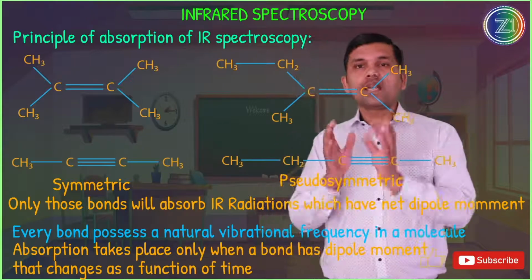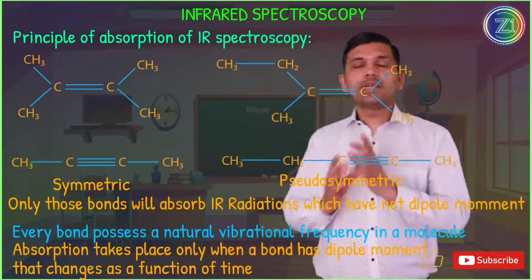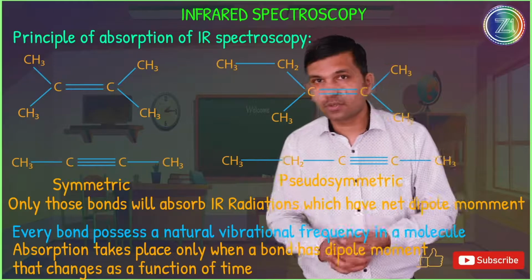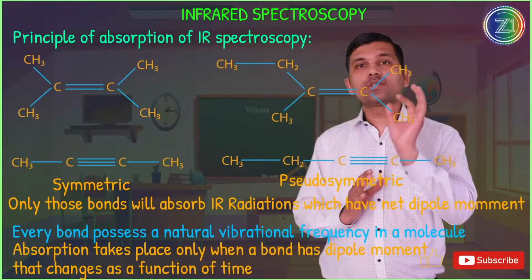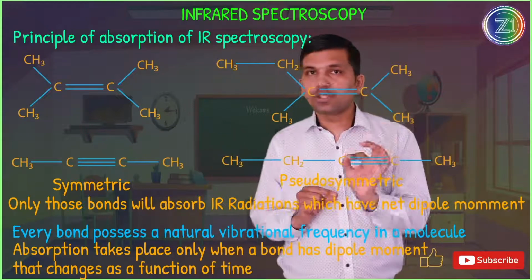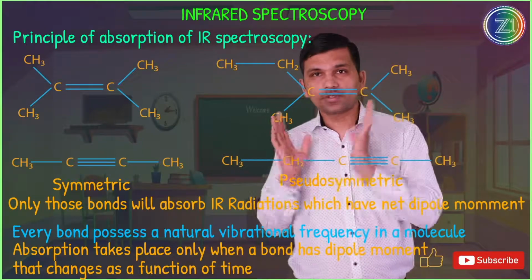I am going to utilize this region of the electromagnetic spectrum for the analysis of IR spectra. Second, I told you that there are other regions that can be utilized for absorption spectroscopy, but I am not going to analyze those. I am going to analyze only a small portion, the vibrational or IR radiation region, the mid-IR region that corresponds to 2.5 to 25 micrometer, or 4000 to 400 centimeter inverse.